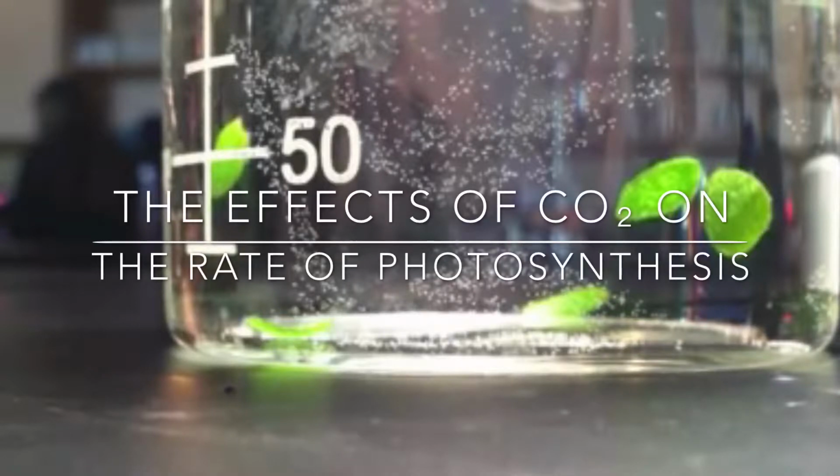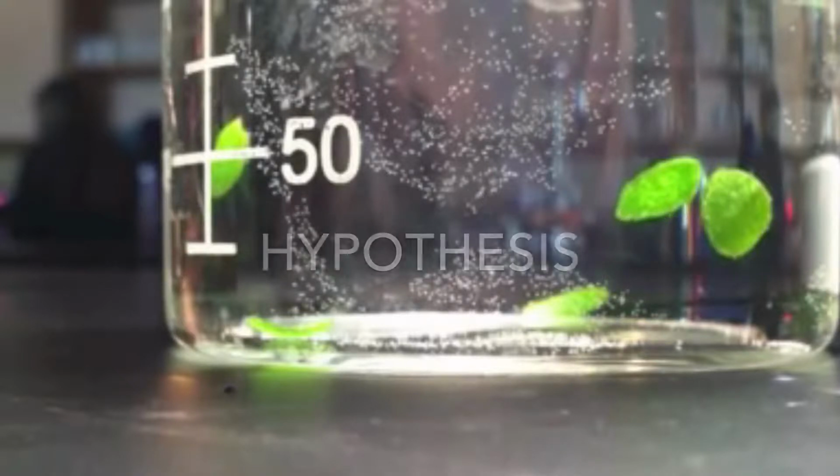The effects of carbon dioxide on the rate of photosynthesis. The purpose of this lab is to determine the effects on the rate of photosynthesis in varying concentrations of carbon dioxide by observing the decrease in density of the plant disc due to the production of oxygen. To do this, we will be observing the rates at which oxygen gas is released by leaf discs submerged in various concentrations of sodium bicarbonate solution.